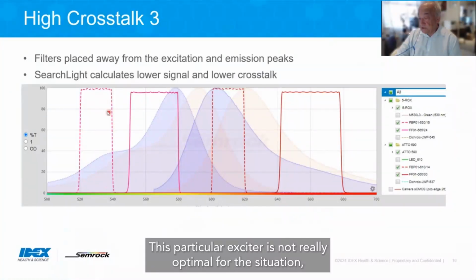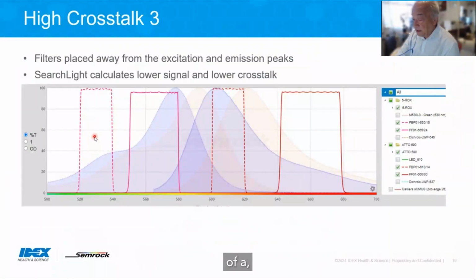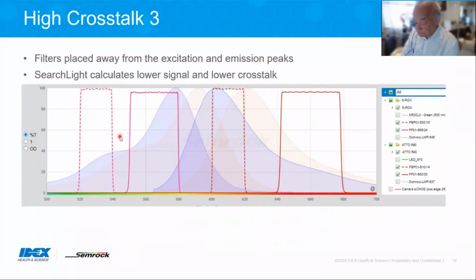This particular exciter is not really optimal for the situation, but it was to some extent forced by a lack of availability of an LED that could be somewhere, let's say, to the red. That would have been somewhat better.